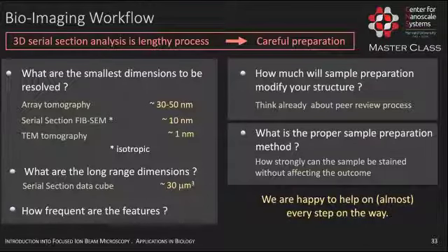So if we want to succeed, we need to carefully prepare. So Nikki and I and many of us are happy to help on the way. So these here are just a few things you might want to think about. For example, what are the smallest dimensions that you need to resolve to understand your problem? That then defines what technique you want to use.